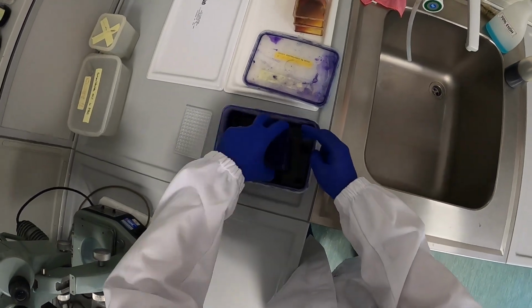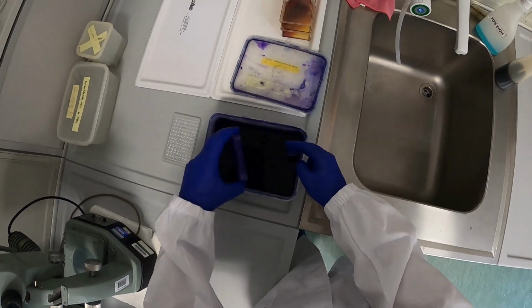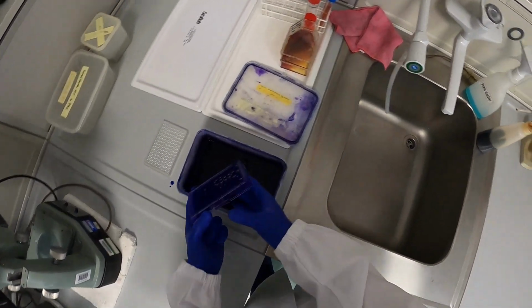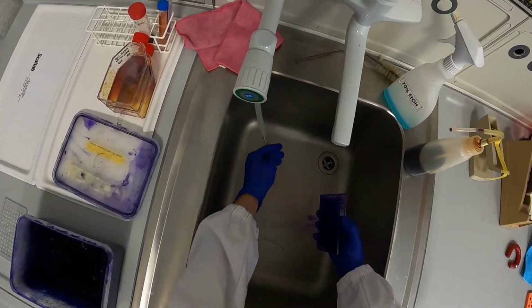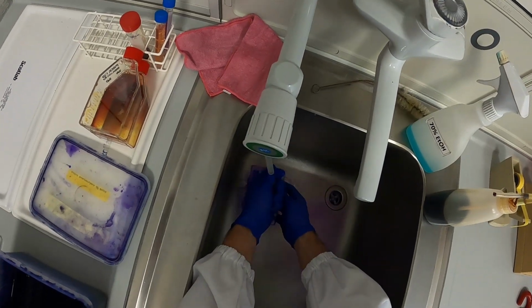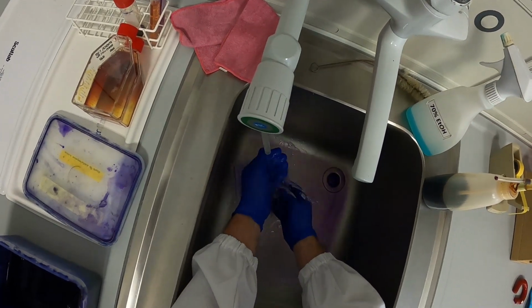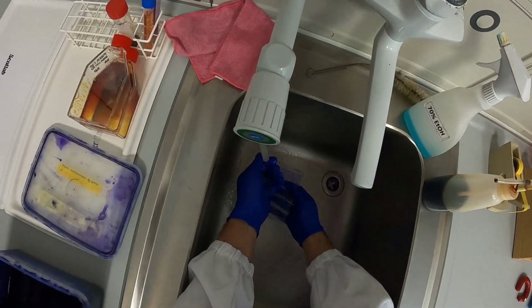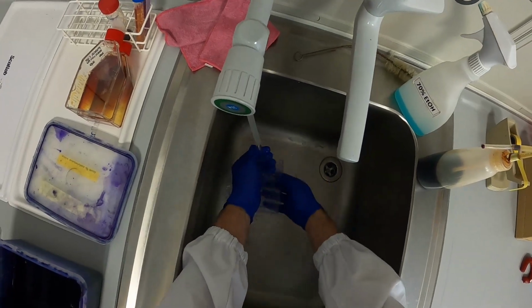However, I see everything went well, and okay, you're just getting rid of the Coomassie blue. Indeed, try to get as much of the blue out of the plate. And then use some water, some distilled water in this case, to rinse away the remaining blue. I'm always trying to block a little bit the flow of water from the tap to not go directly onto the cells, but they are pretty fixed and adhered, so don't worry too much.